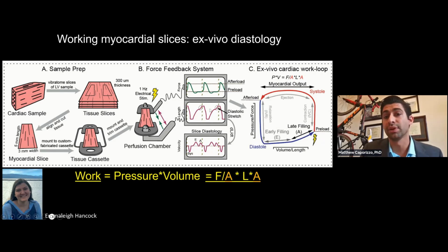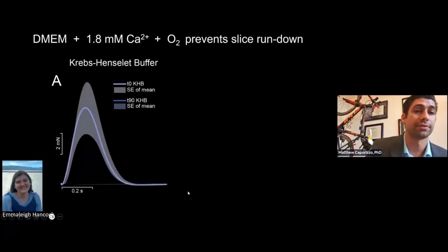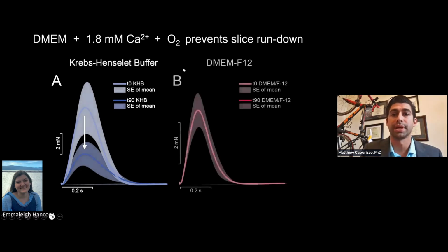And if we take the derivative of this length trace shown here, we can get what's effectively a velocity of expansion of the ventricle, which mimics this mitral Doppler result. And so to do this and to look at the effect of colchicine, we discovered very quickly, because it took 90 minutes to depolymerize the microtubule network, that if we used a typical Krebs-Henseleit buffer as used in a lot of these experiments, we had this continuous reduction in our total force. And so we moved to a media that was supplemented with physiological calcium. And again, we're continuously oxygenating this.